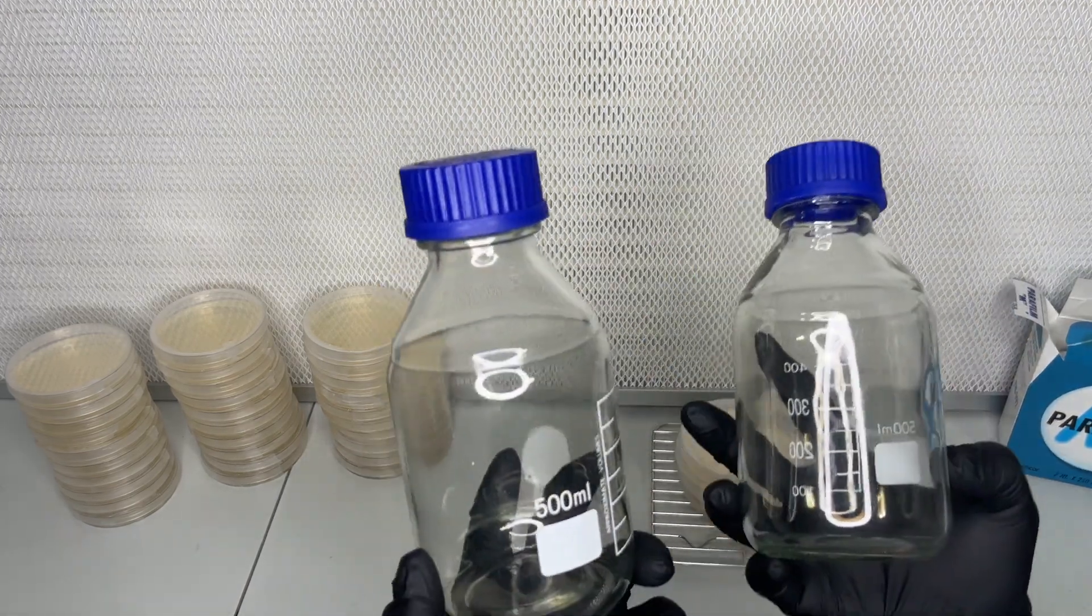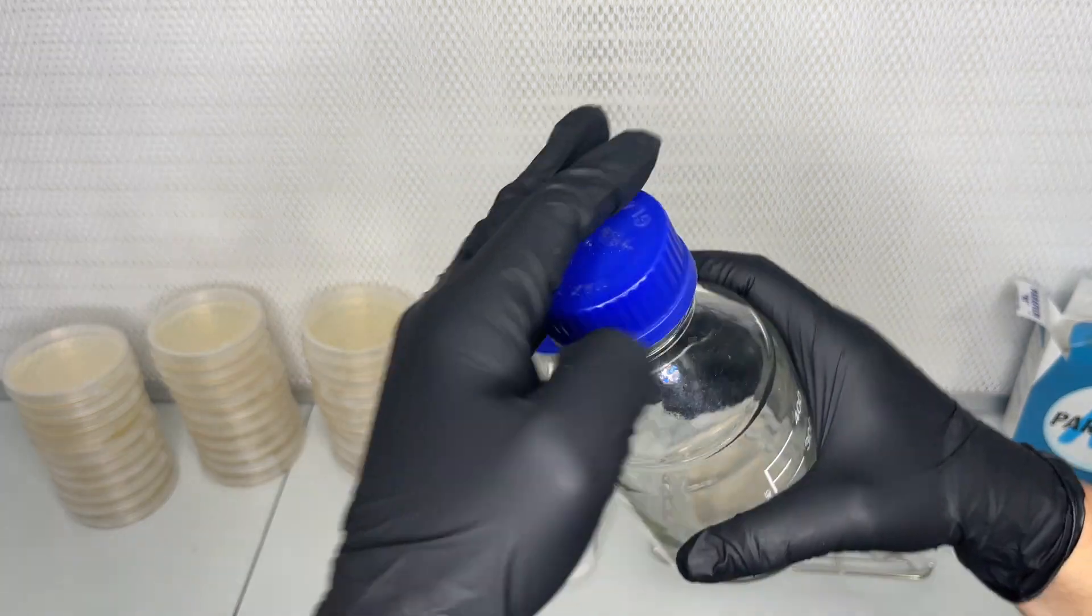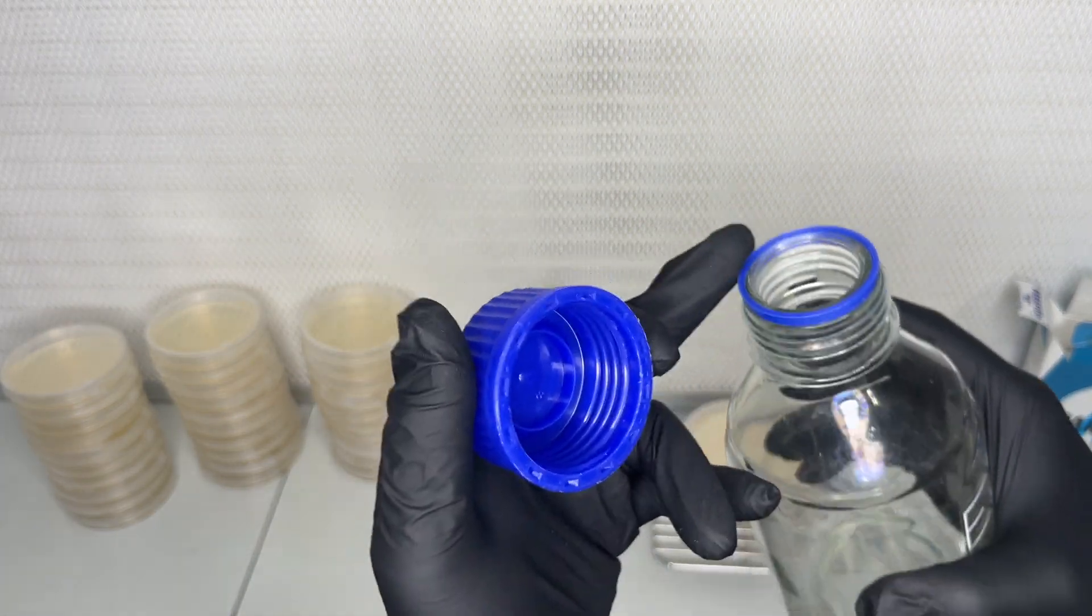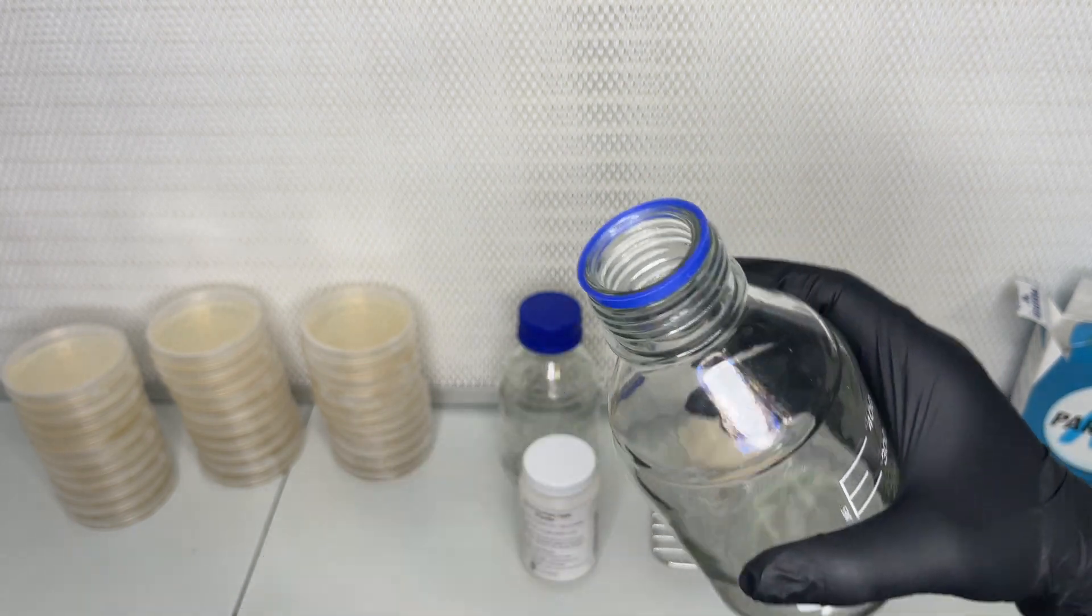And these media bottles are great for pouring the agar into the petri dishes. They have a ring at the top that prevents dripping when pouring the agar.